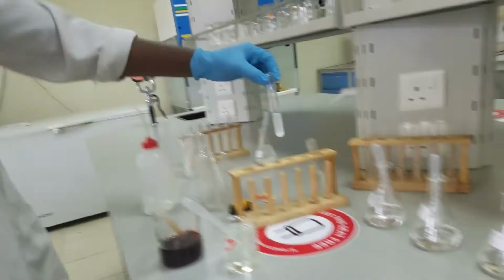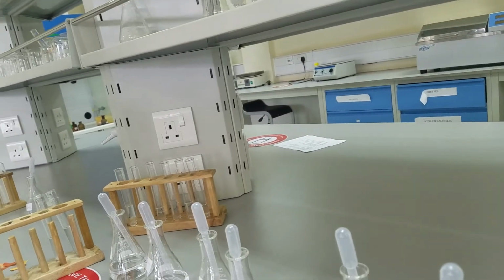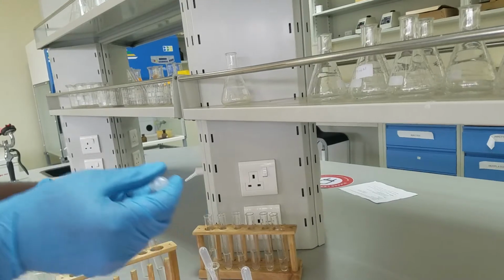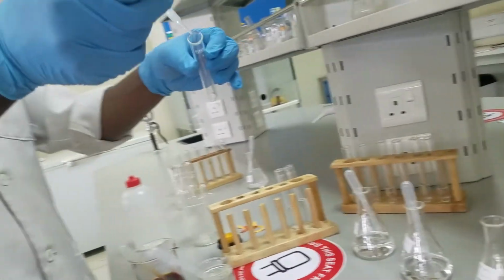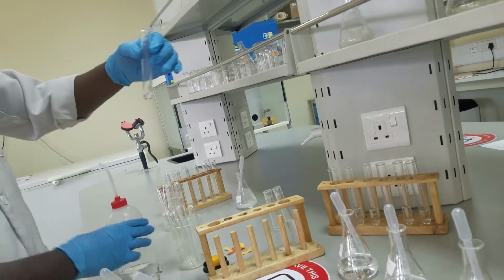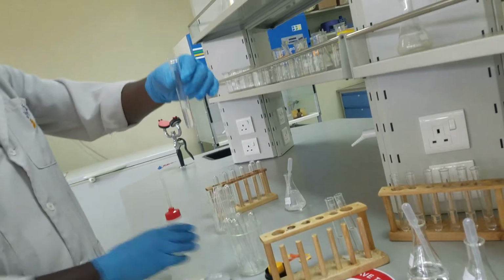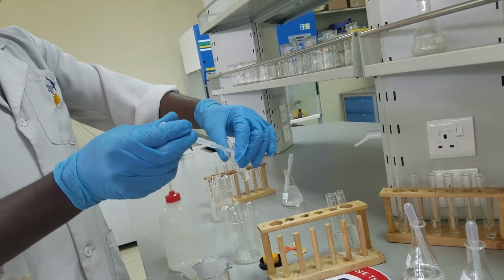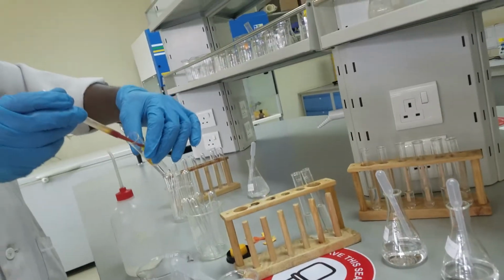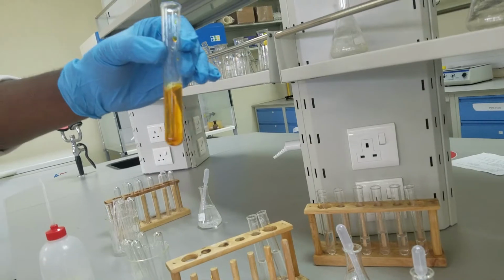So from the literature you should be able to know what we use our iodoform test for, what type of analysis, for what identification. So I'll go to acetic acid, repeat the same procedure. Sodium hydroxide, then that is acetic acid.